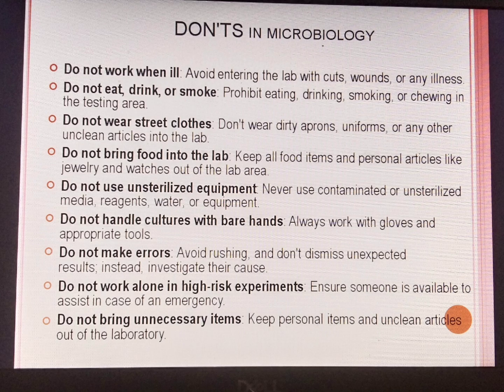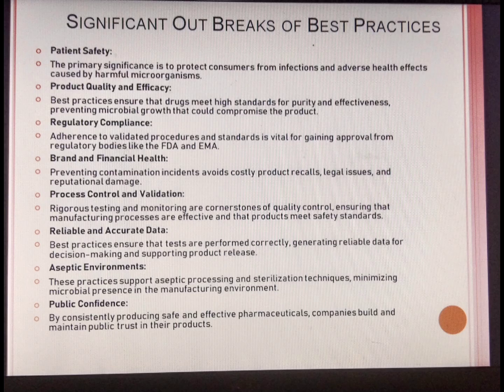Do not make errors. Avoid rushing and don't dismiss unexpected results. Instead, investigate their root cause and define a concrete CAPA. Do not work alone in high risk experiments. Ensure someone is available to assist in case of an emergency. Do not bring unnecessary items. Keep personal items and unclean articles out of the laboratory.